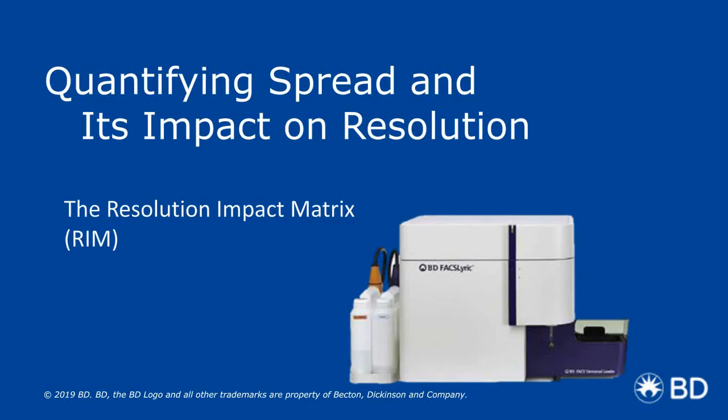So now that we understand the relationship between spillover and spread and its impact on resolution, let's see how we can quantify this. And what we're going to talk about is a metric that we've developed here at BD called the resolution impact matrix. There are other metrics out there, and each has its own unique value and way of using it. One is not inherently better than the other. Another major approach is that developed by Mario Roederer and currently implemented in FlowJo, and that's the spillover spread matrix. They work slightly differently, but the concept is essentially identical.